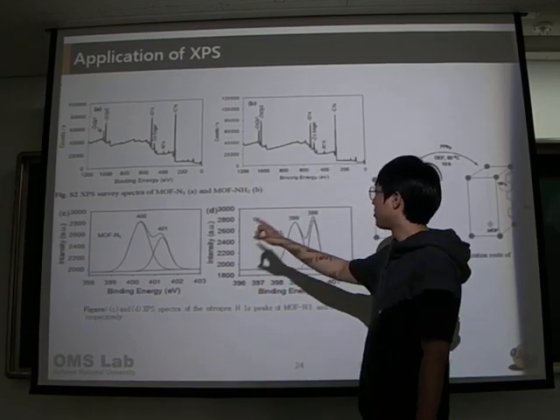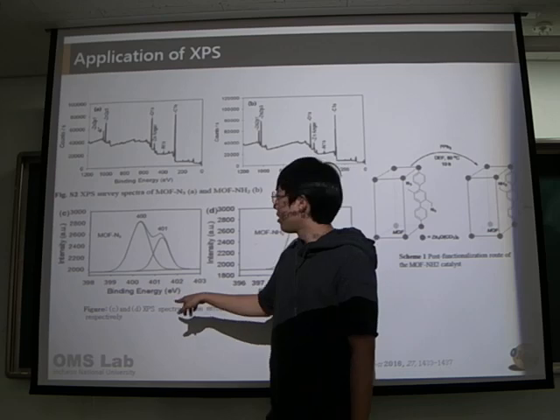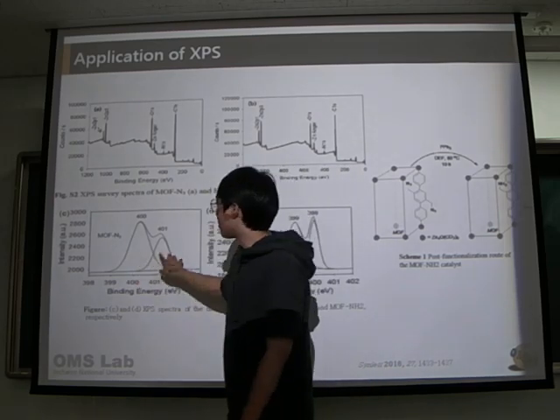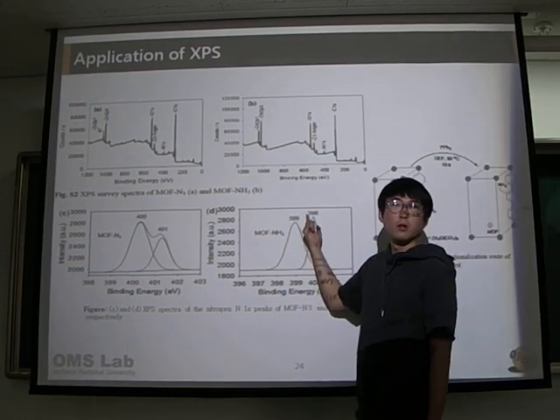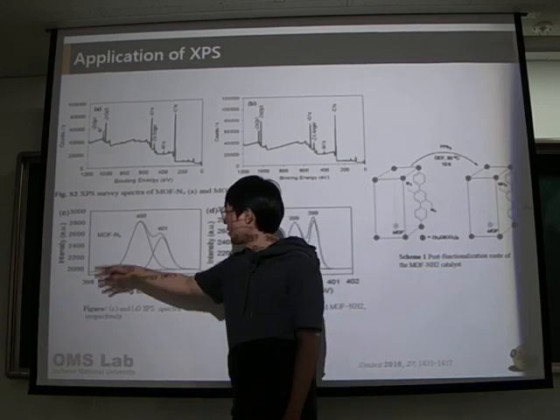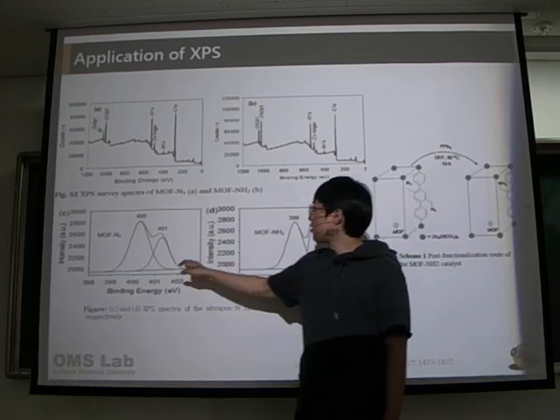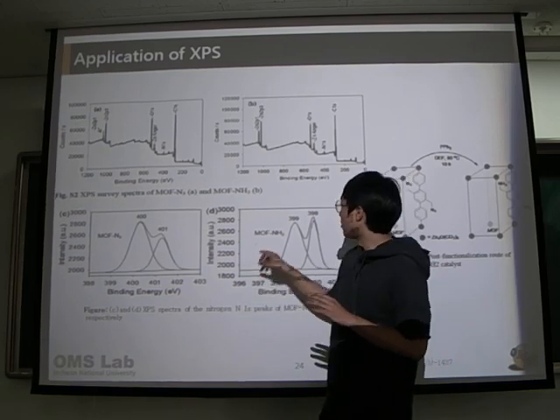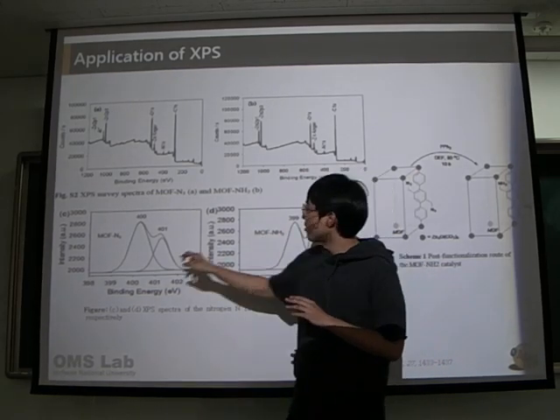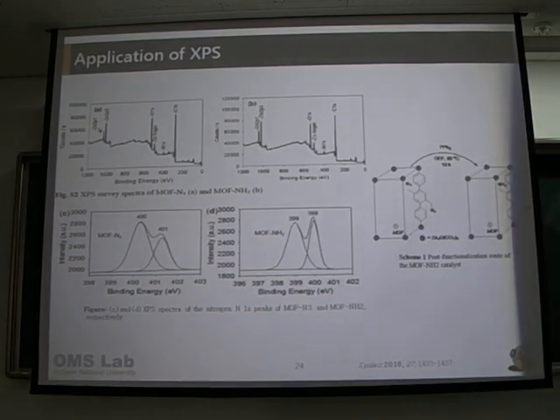원래는 제 생각엔 이걸 분석할 때는 여기서는 이미 포인트가 벗어나서 안 집어넣어도 괜찮은 것 같은데, for example this area is located on here, you should assign this peak also. Okay? Now this peak is outside of this range so this peak is not denoted, but if this graph is located over here, for comparing the conversion ratio, you should assign this peak also. Okay. 그래서 지금은 벗어났기 때문에 상관없는데 들어가 있을 때 같이 해서 비교를 하는 게 맞을 것 같아요.